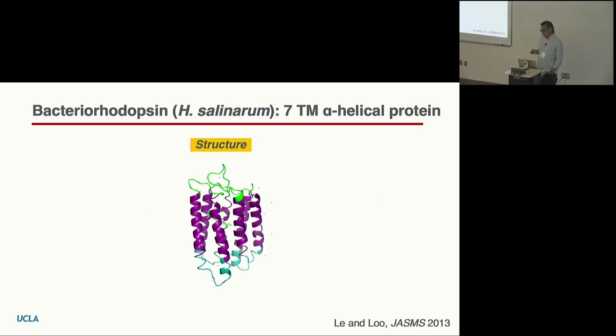So as I said, I have a slide on lipids. And under ideal conditions, you can take the intact membrane and then solubilize that in a detergent and then put that into a mass spectrometer. So here's an example we just published a year ago. This is a protein called bacteriorhodopsin. It's a protein with 7 transmembrane domains. It exists as a monomer normally.